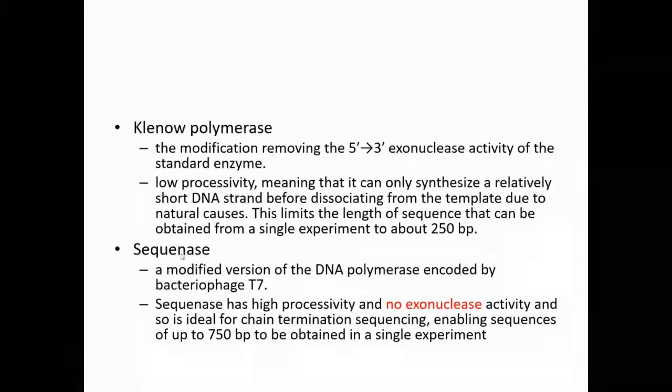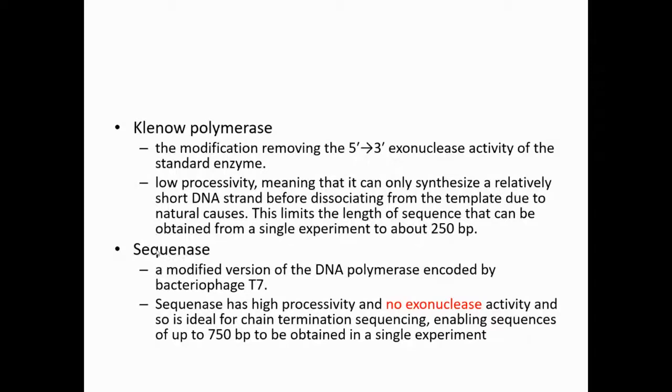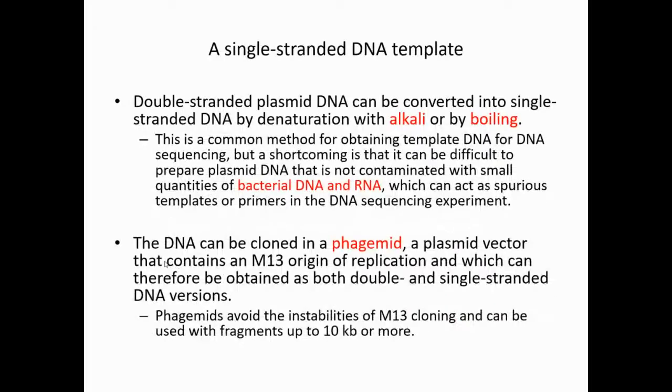Another one commonly used is called T7 Sequenase. This one was commonly used in the early days.